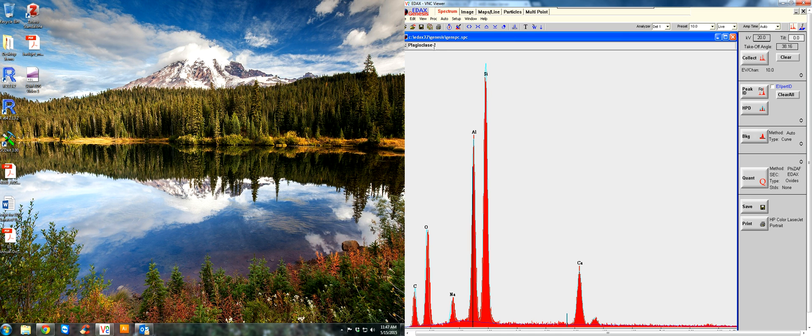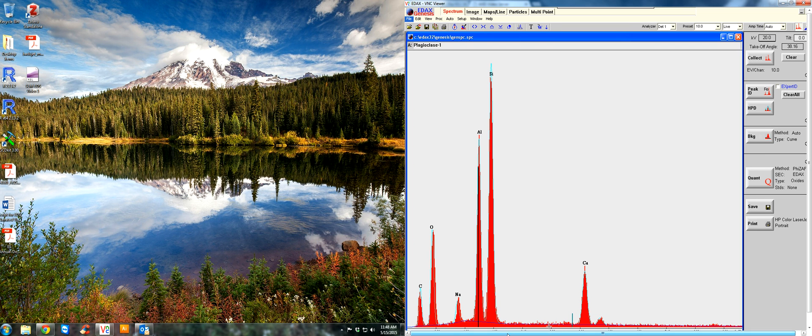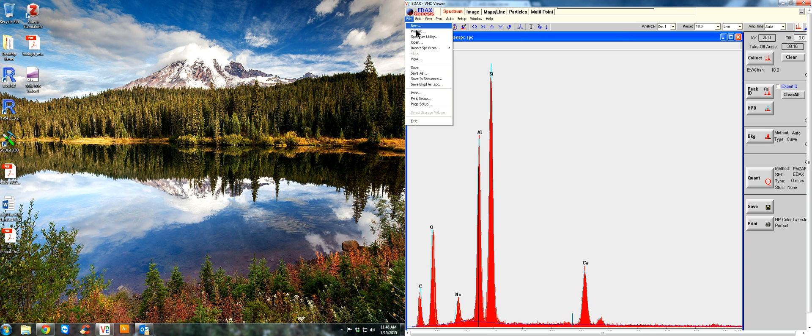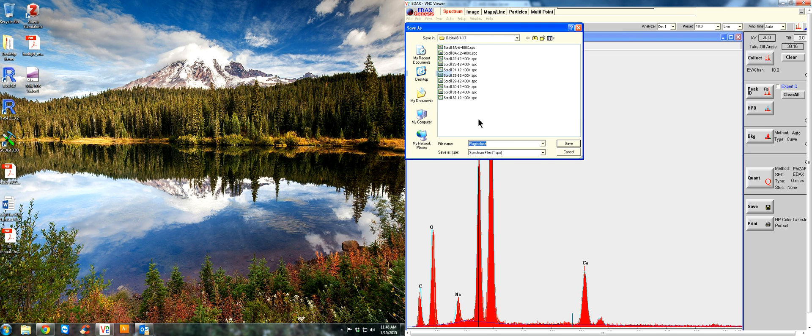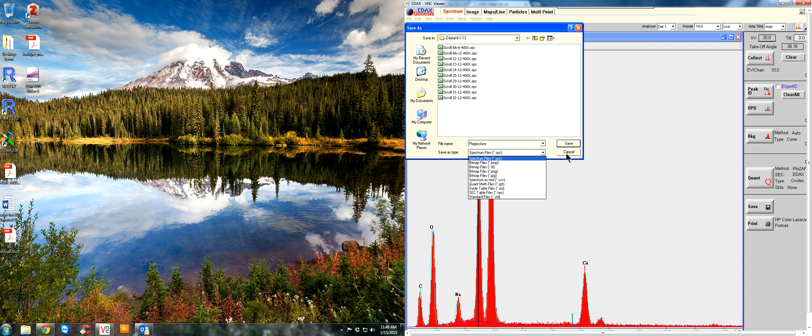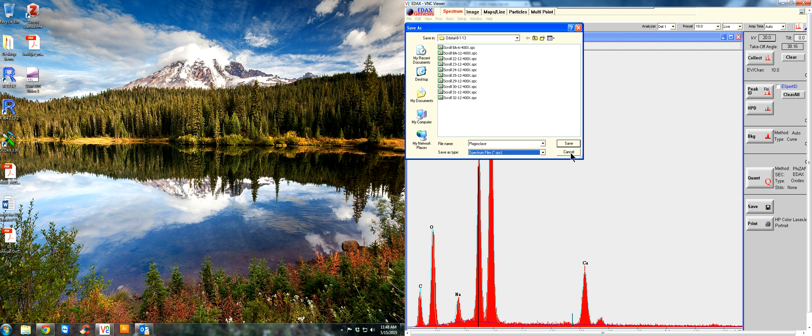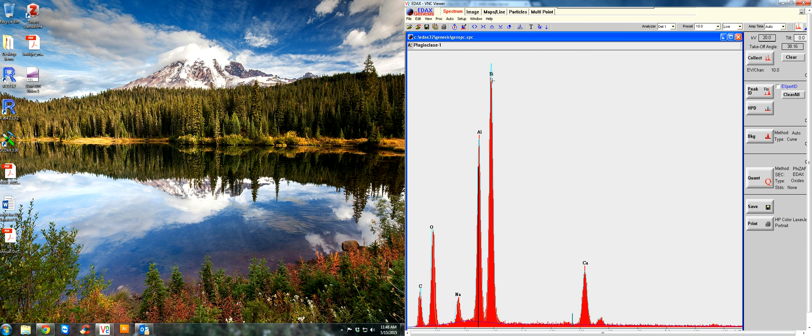And the way you would save it is right here. Hit file, save as. And it'll say you can save it as spectrum files. And then choose a folder, create a folder for yourself. A lot of times I like to put it in my documents or somewhere where I can easily find it. And if you want this information, then you can ask us to email it to you.